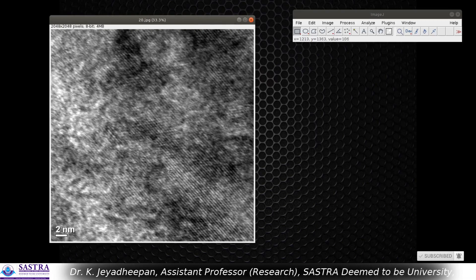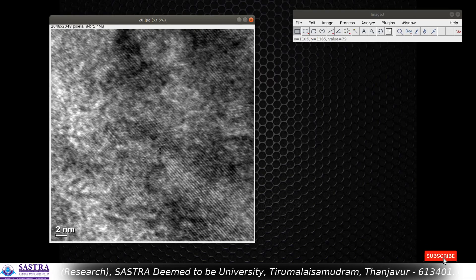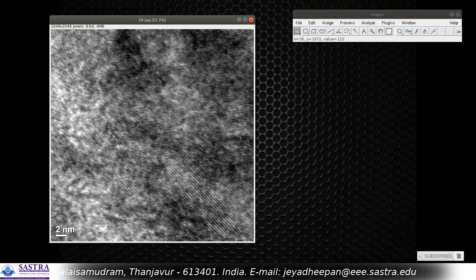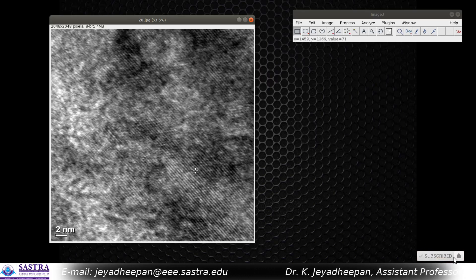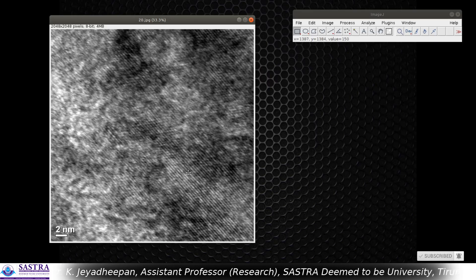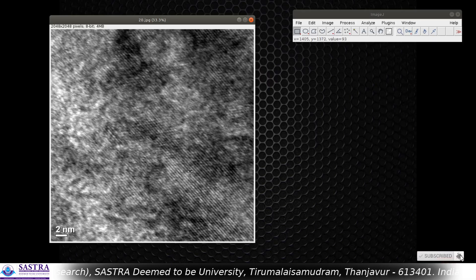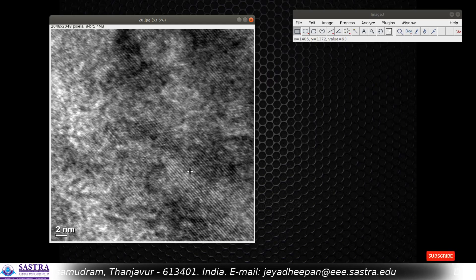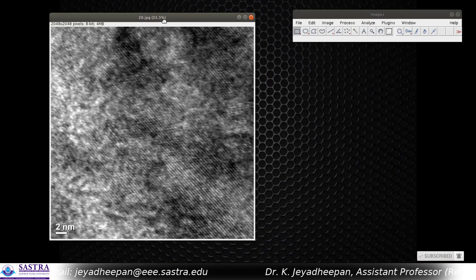Here you can see some lattice fringes, and I am going to measure them. Many methods are available — even by calibrating the scale you can draw a straight line and find out the distance between lines. But here we are going to see the exact procedure to determine the D-spacing at ultimate resolution.